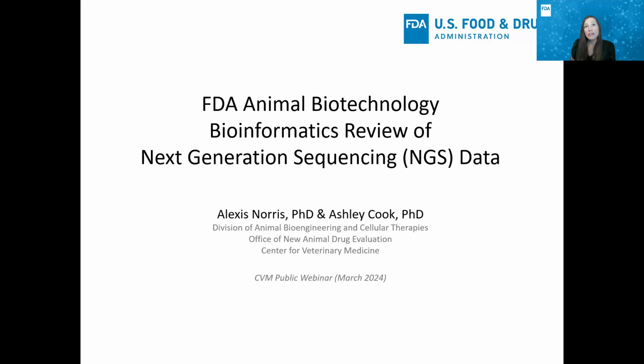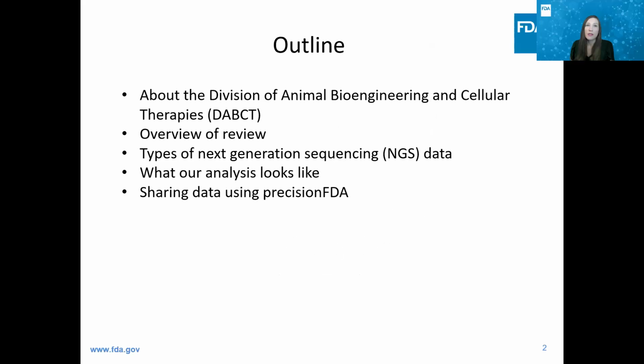As part of the review process, CVM performs an independent analysis of the NGS data submitted by the developers. This webinar provides an overview of that analysis and describes how to submit large NGS datasets to CVM that support the molecular characterization of IGAs in animals.